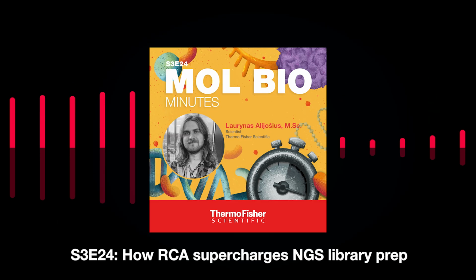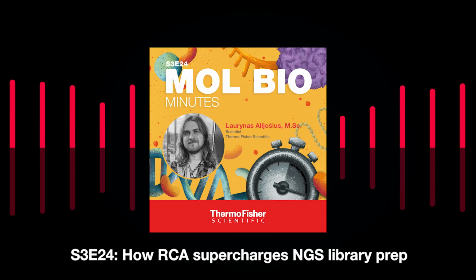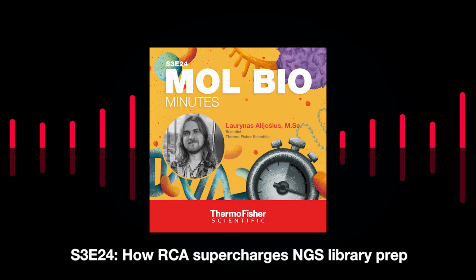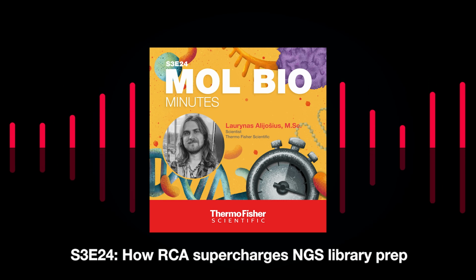Also, there are things to consider after the amplification with the RCA method. Firstly, it's post-amplification debranching. RCA produces a branched DNA product, and that sometimes can be disruptive for downstream applications, especially for nanopore-based sequencing. But don't worry, because there are ways to remove the branched DNA.